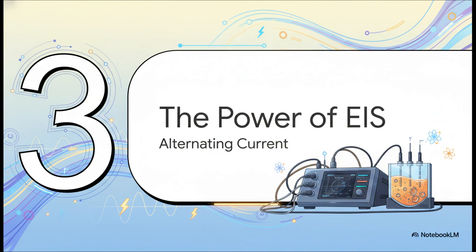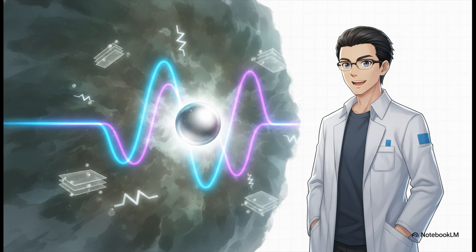Which brings us to Section 3, the power of EIS and the alternating current revolution. To bypass those severe DC limitations, we ditch the static push and use tiny sinusoidal waves across various frequencies instead. By applying an alternating current potential, electrochemical impedance spectroscopy, or EIS, allows us to create an equivalent electrical circuit model. This brilliantly isolates the true, actual polarization resistance from the interference of those pesky insulating coatings or low conductivity solutions.